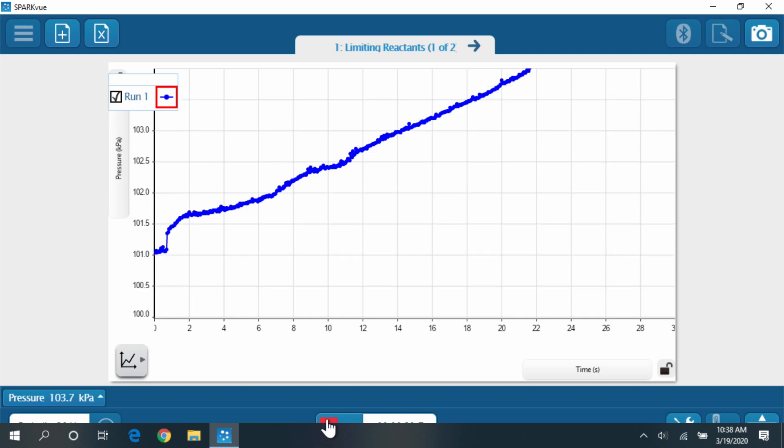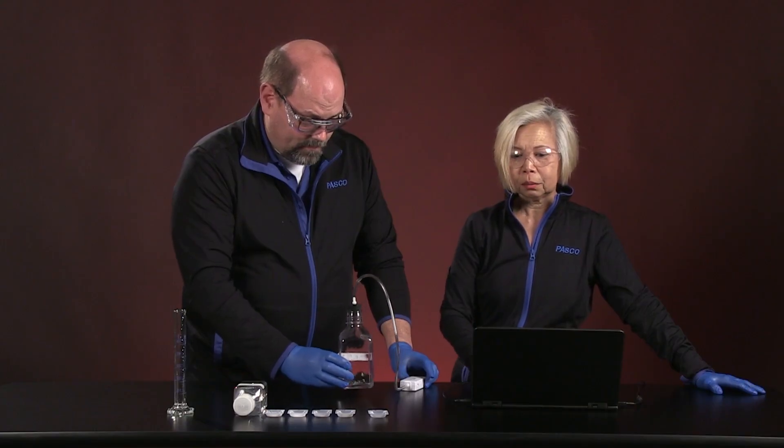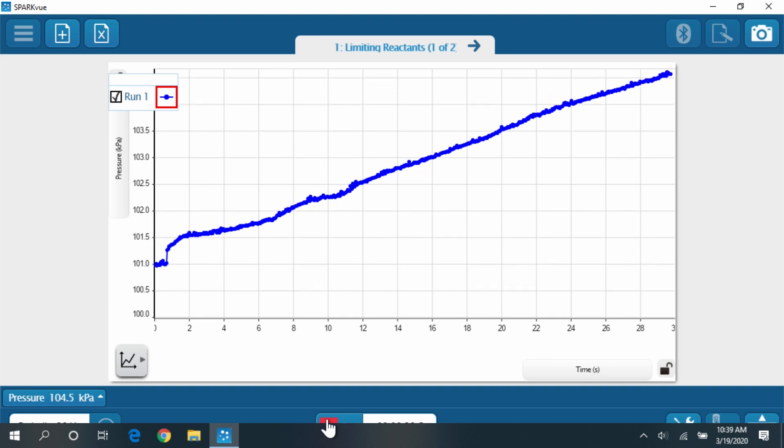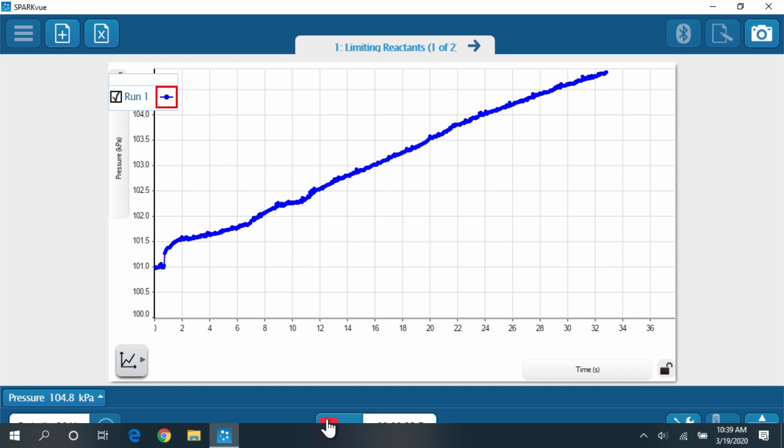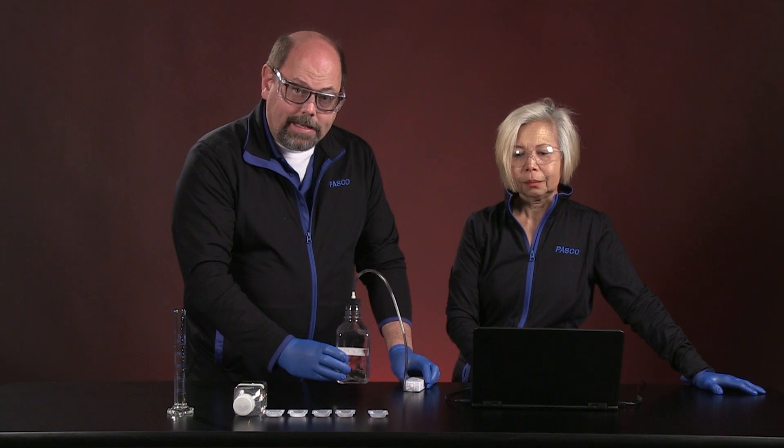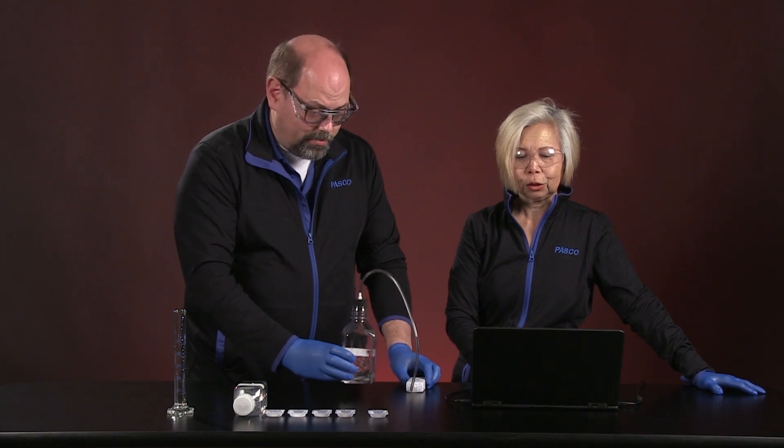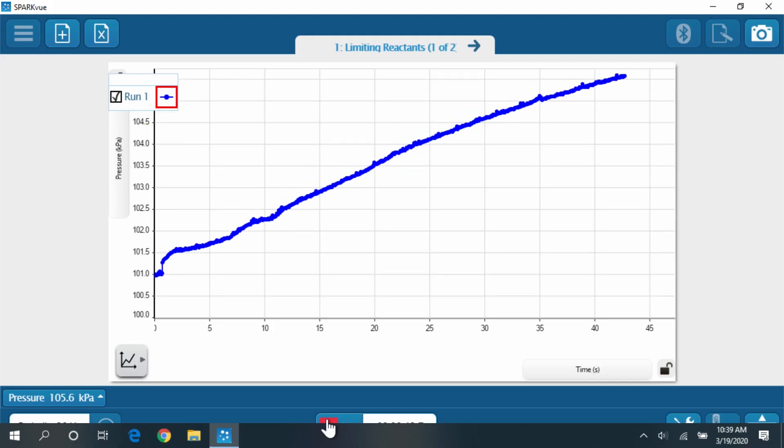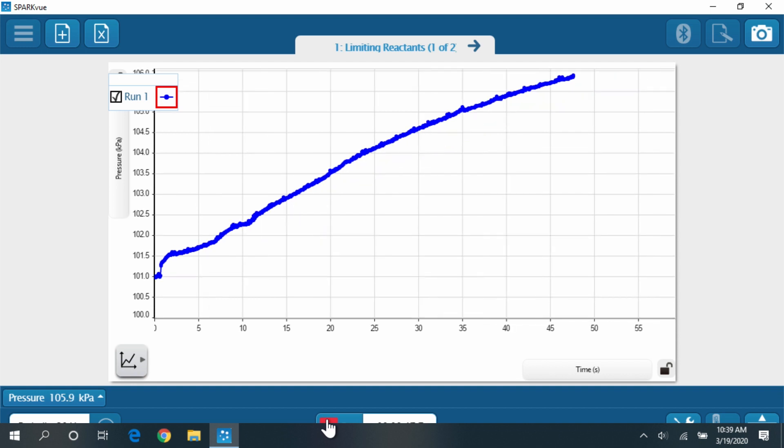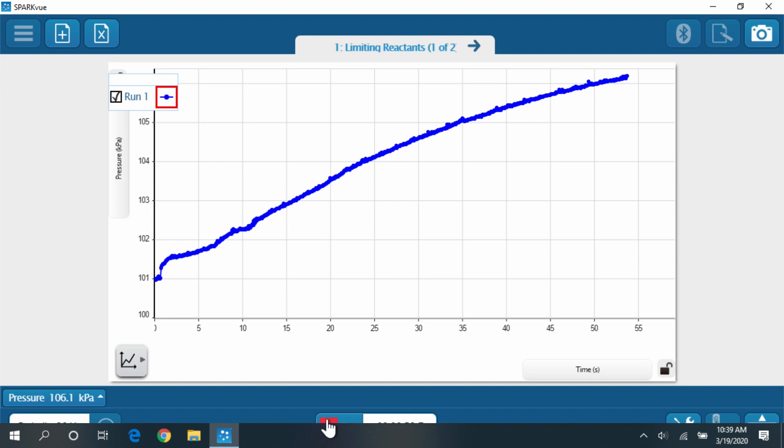And how long are we going to measure this? We're going to be measuring this for about 60 seconds. Unless it flattens out very quickly, in which case, all of the material has reacted and all the CO2 has been given up. That's right. Looks like it's starting to curve a little. It's beginning to slow down just a little bit. Nice. Yep. It's almost to flat.